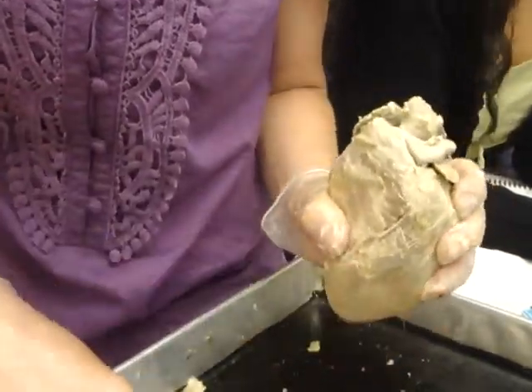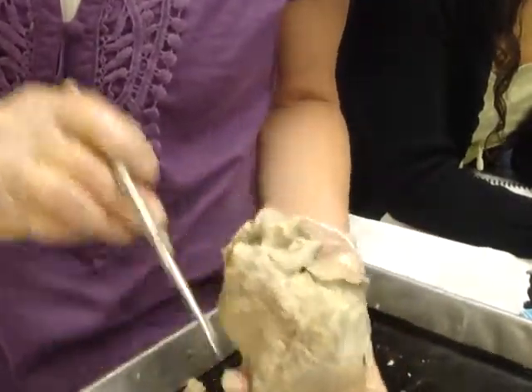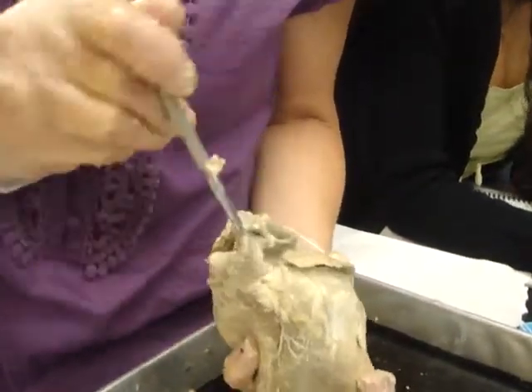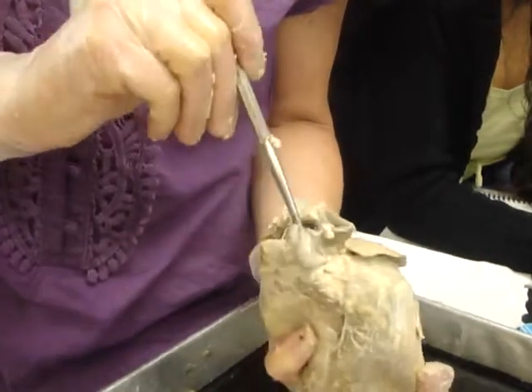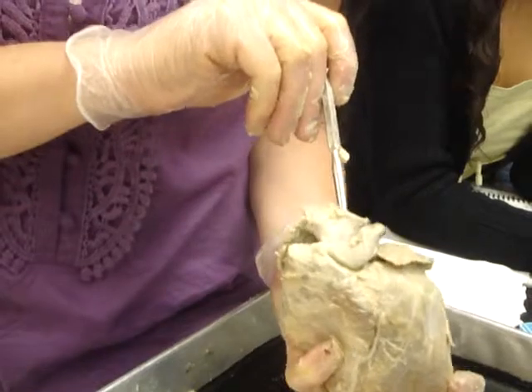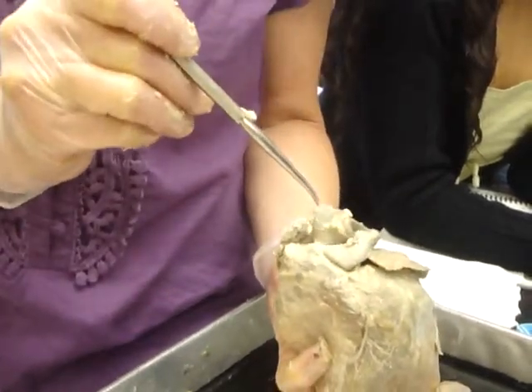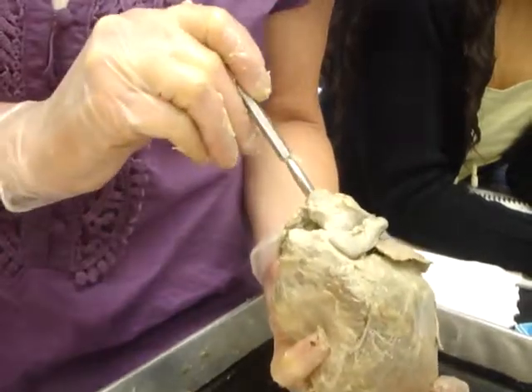From the anterior side you can see the pulmonary trunk, the aortic trunk, the aorta, and the brachiocephalic.